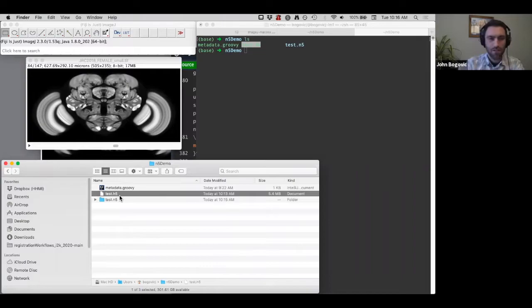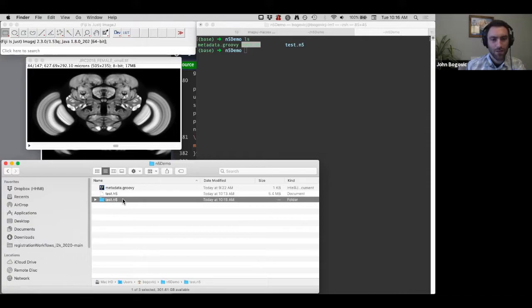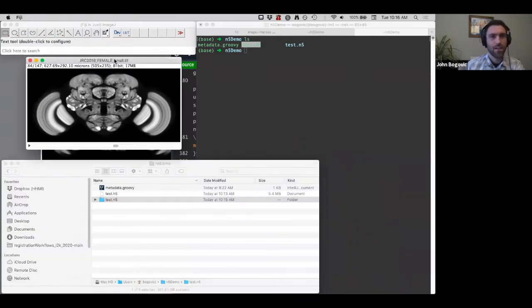And years ago, when we were processing a large amount of data, we wanted to easily be able to write to these chunks in parallel. And so our group developed this format. And around the same time, the Python community developed Zarr, and it solves this same problem in pretty much the same way, in that it writes these chunks as separate files.